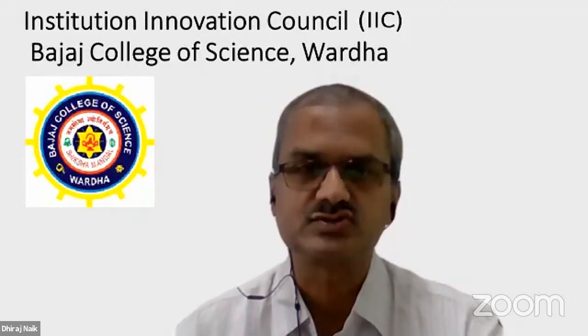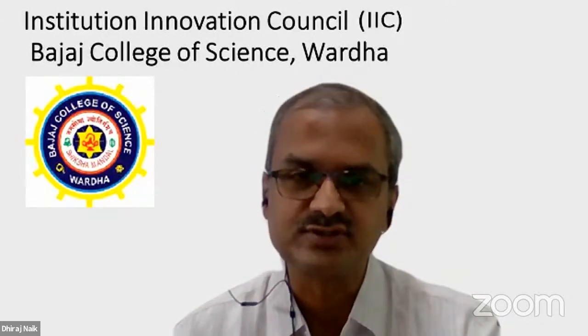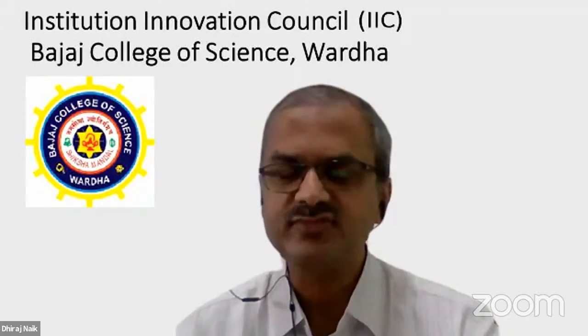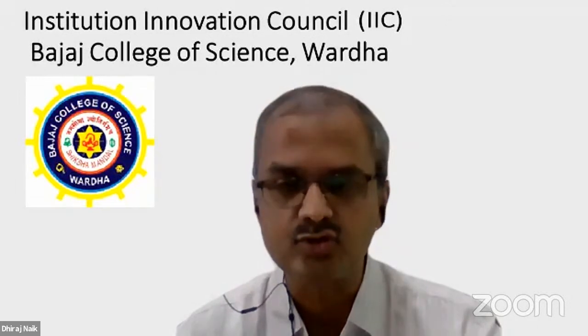These compound microscopes cost 6,000 to 15,000 Indian rupees. They occupy space in the lab and they require maintenance as well. During this pandemic time, we ended up creating many virtual lab practicals with this microscope, and the students had very little practical experience handling it. So there is a serious limitation in the post-pandemic time that we are facing right now. And therefore, Foldscope could be one of the best low-cost portable microscopes which could be used by our students.